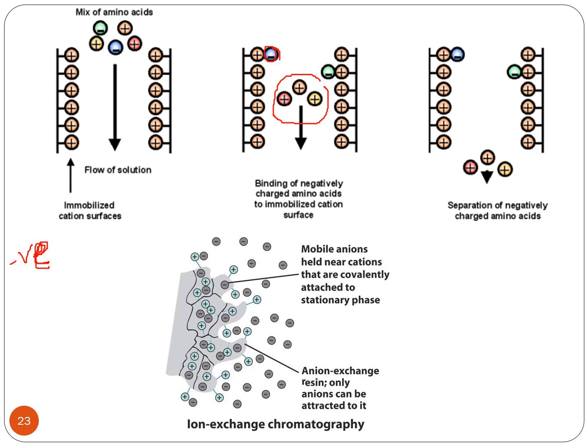Okay, so after that, yang melekat ni adalah anion yang warna biru dan anion yang warna hijau. And kita tahu dua-dua ni ada different strength of anion lah. So cara untuk kita tahu yang mana will elute first ataupun yang mana yang elute last, kita akan supply with the mobile phase.